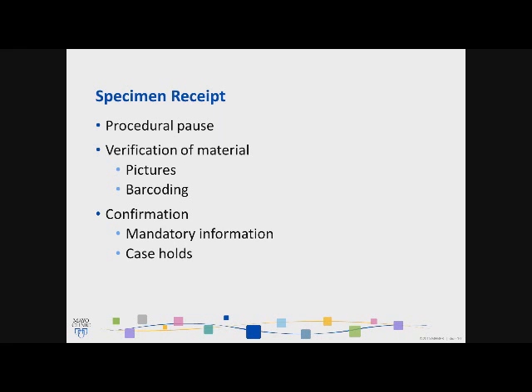And these are not only for billing purposes, but just to verify that we have the correct patient. It is important that we receive all this information. And while the consultants, again, or pathologists often rush these cases, it's important that we receive all that information to verify that it is the correct patient so that information can go back to the right doctor.